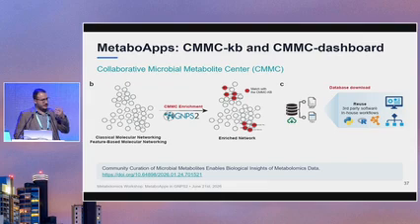So as I mentioned to our colleague before, you have that information on your fragmentation pattern, on the metadata that you already know for your study, but then you do the enrichment. So basically you add more information based on the matches that you have for the CMMC knowledge base. So basically you add that information that it might be, or for some cases you already are certain that it's related to some strain of microbes or to some host or microbiome study and all that information.